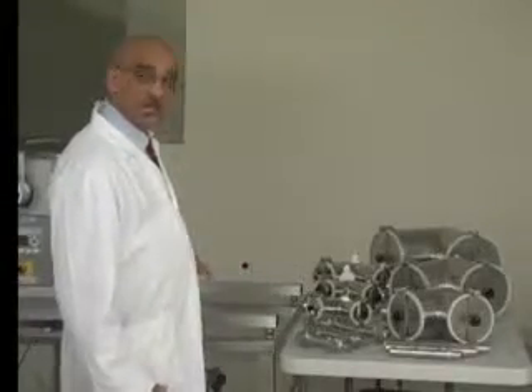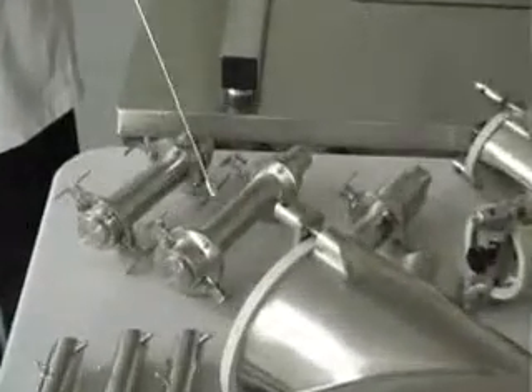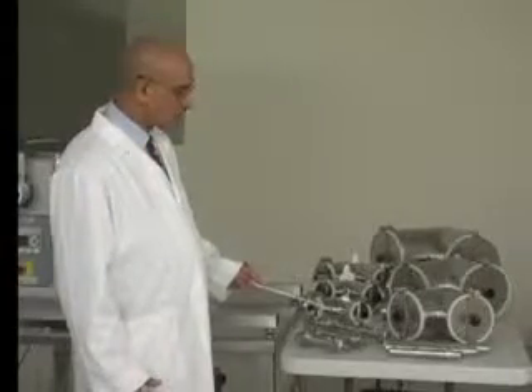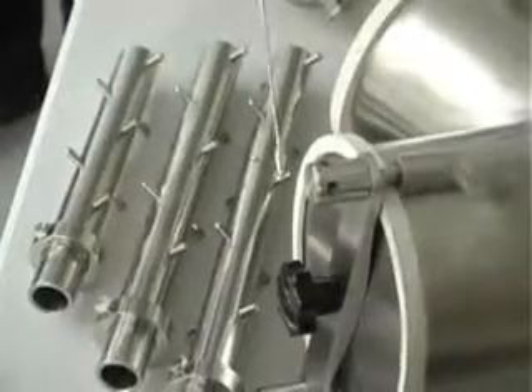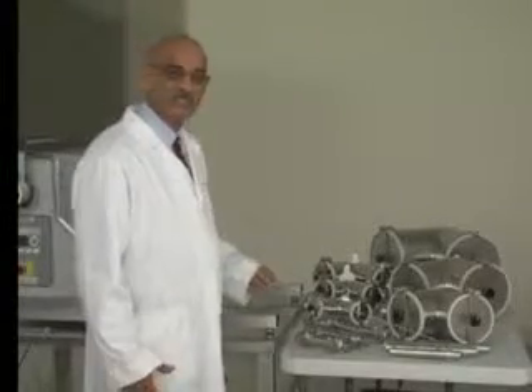These are the high speed intensifier bars for the 4 quart, 8 quart, and 16 quart shells, and these are the pin intensifier bars for the 4 quart, 8 quart, and 16 quart shells. Of course, the intensifier bars are the same.